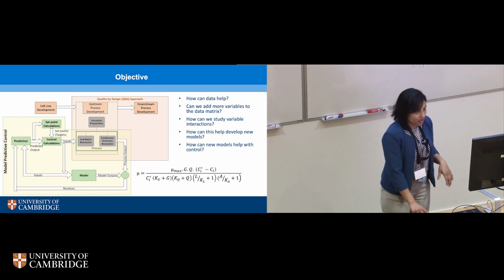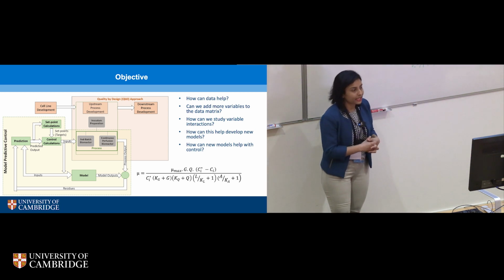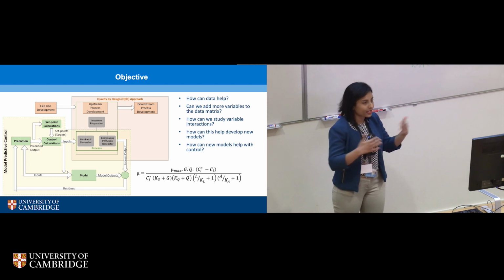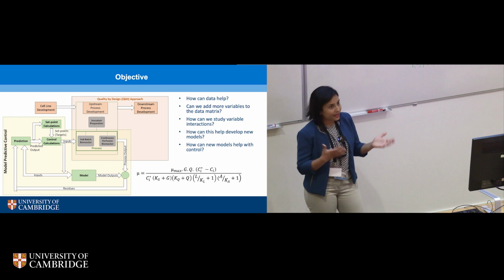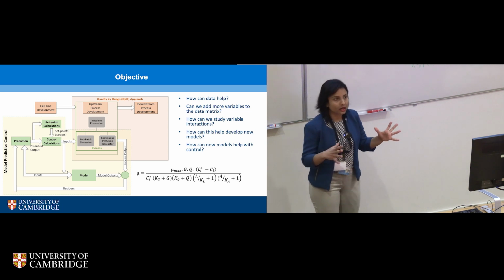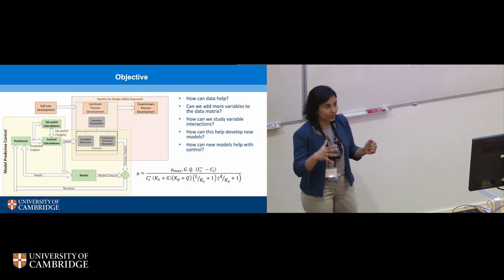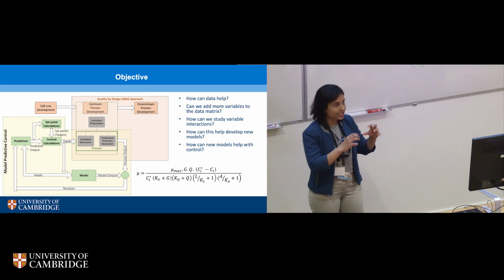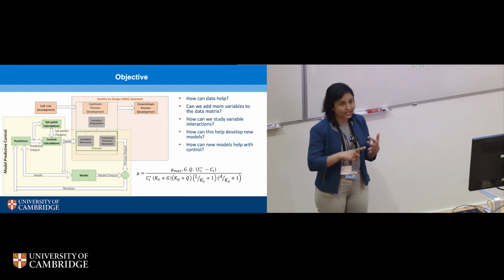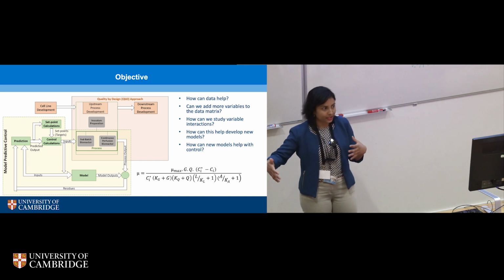In literature, you come across these kinds of equations, which are mechanistic equations that explain an actual relationship going on within these bioreactors. But the problem here is that you will come across hundreds of these equations. The main reason for this variability is that these equations are derived for a specific set of experimental conditions. For a specific process type or cell type, you would have one equation, which is not cross-compatible with a different kind of equation.